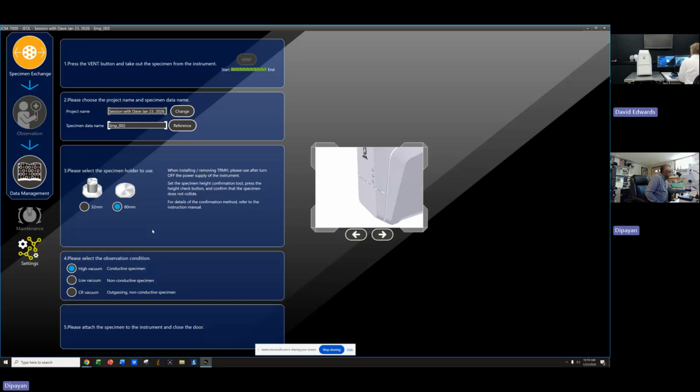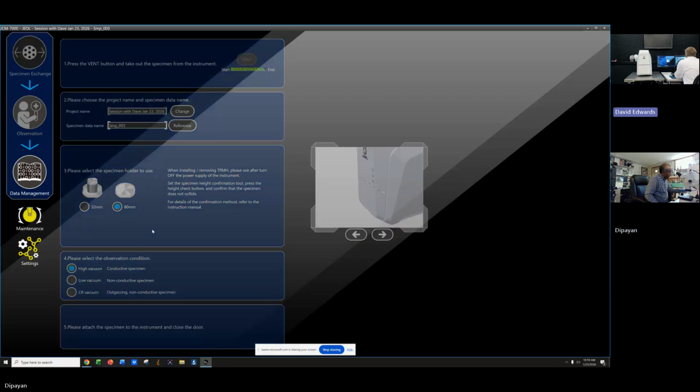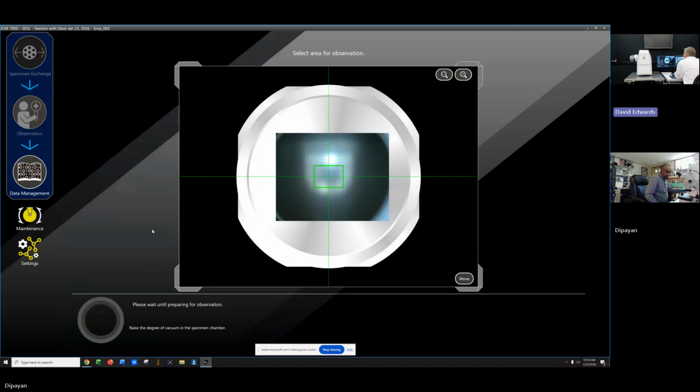I would reach out to service and just tell them what you've done. That you did a complete power down, including the box, and a complete shutdown on the PC and powered it back, and there's still no image. So for whatever reason, your chamber scope is not functioning.